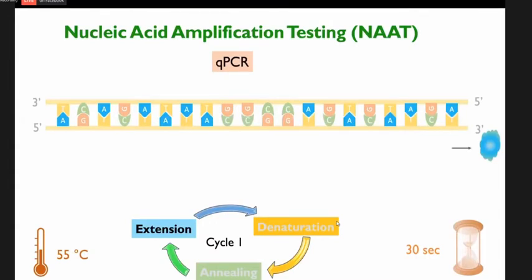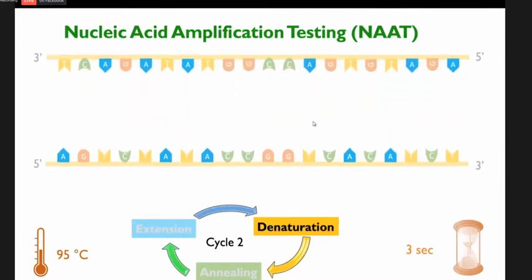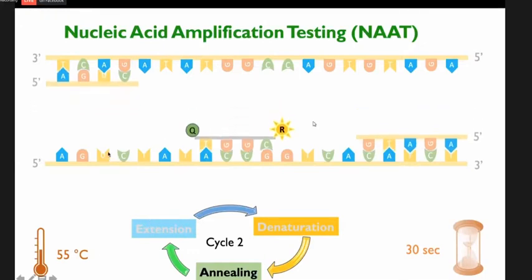After the first cycle, the double-stranded DNA target is obtained. Then the denaturation of this double-stranded DNA is performed, yielding 2 single-stranded DNA molecules, followed by the annealing step, where the temperature is again decreased, allowing the annealing of the reverse and forward primer to the complementary strand, along with the annealing of TaqMan probe to the complementary part of the target DNA.